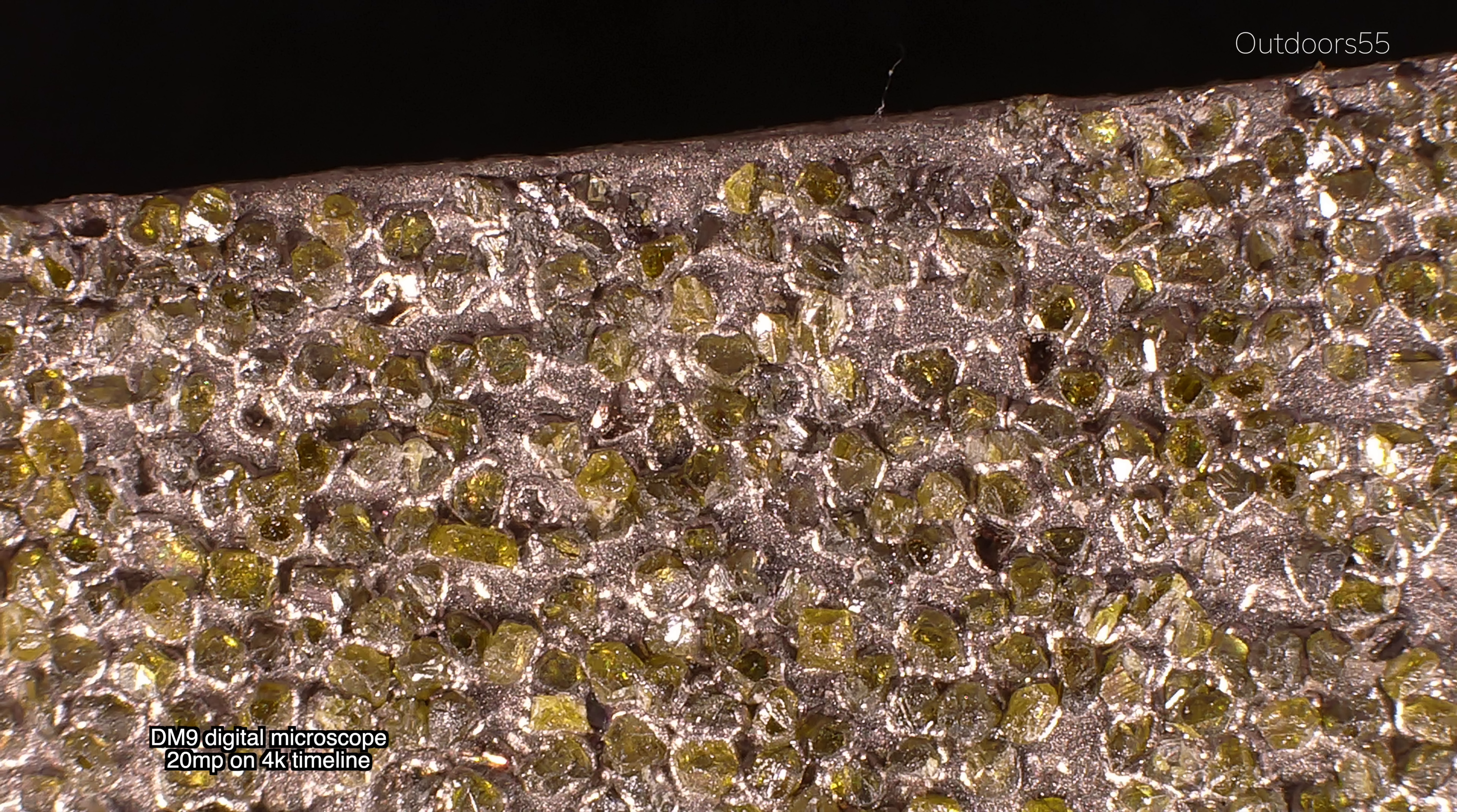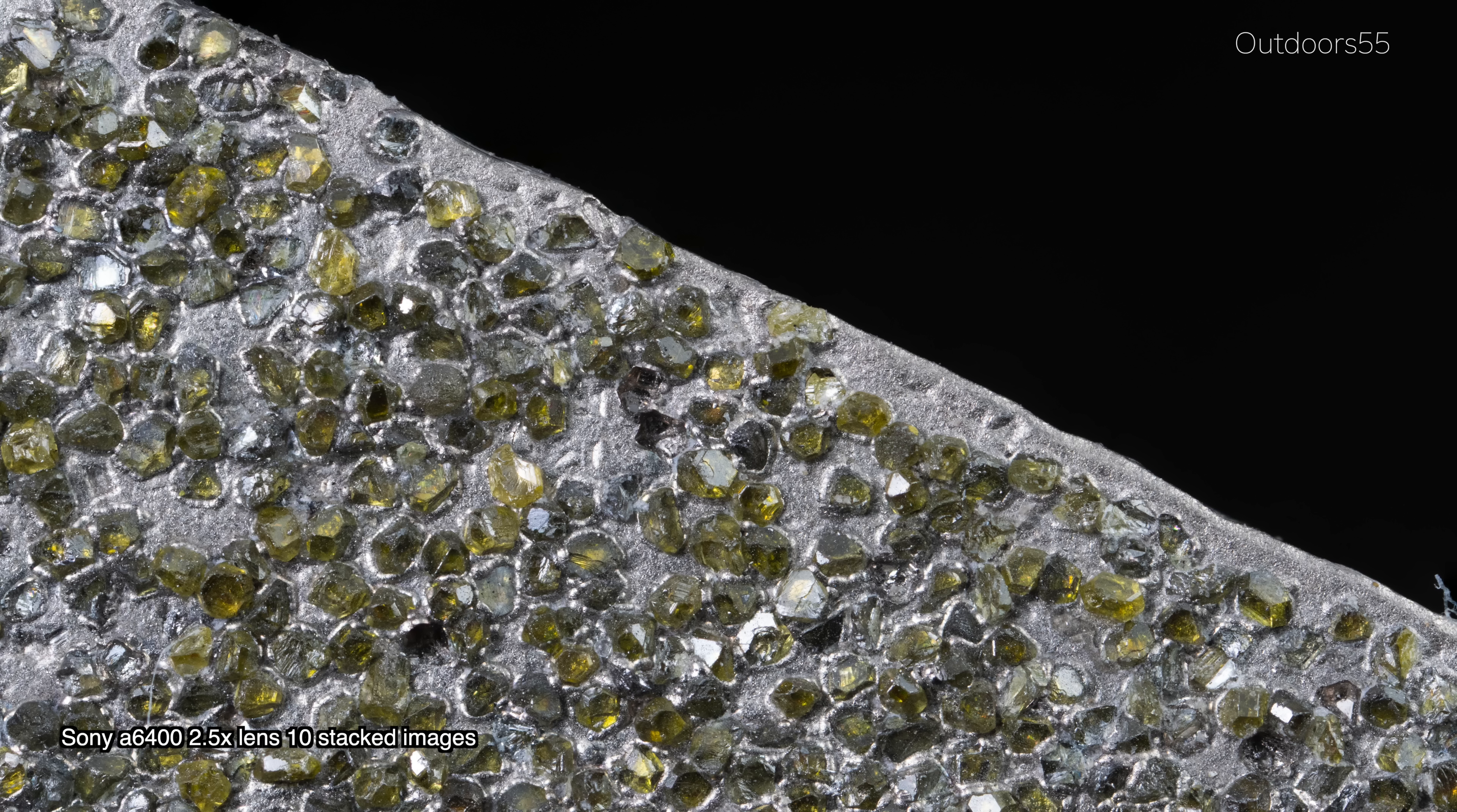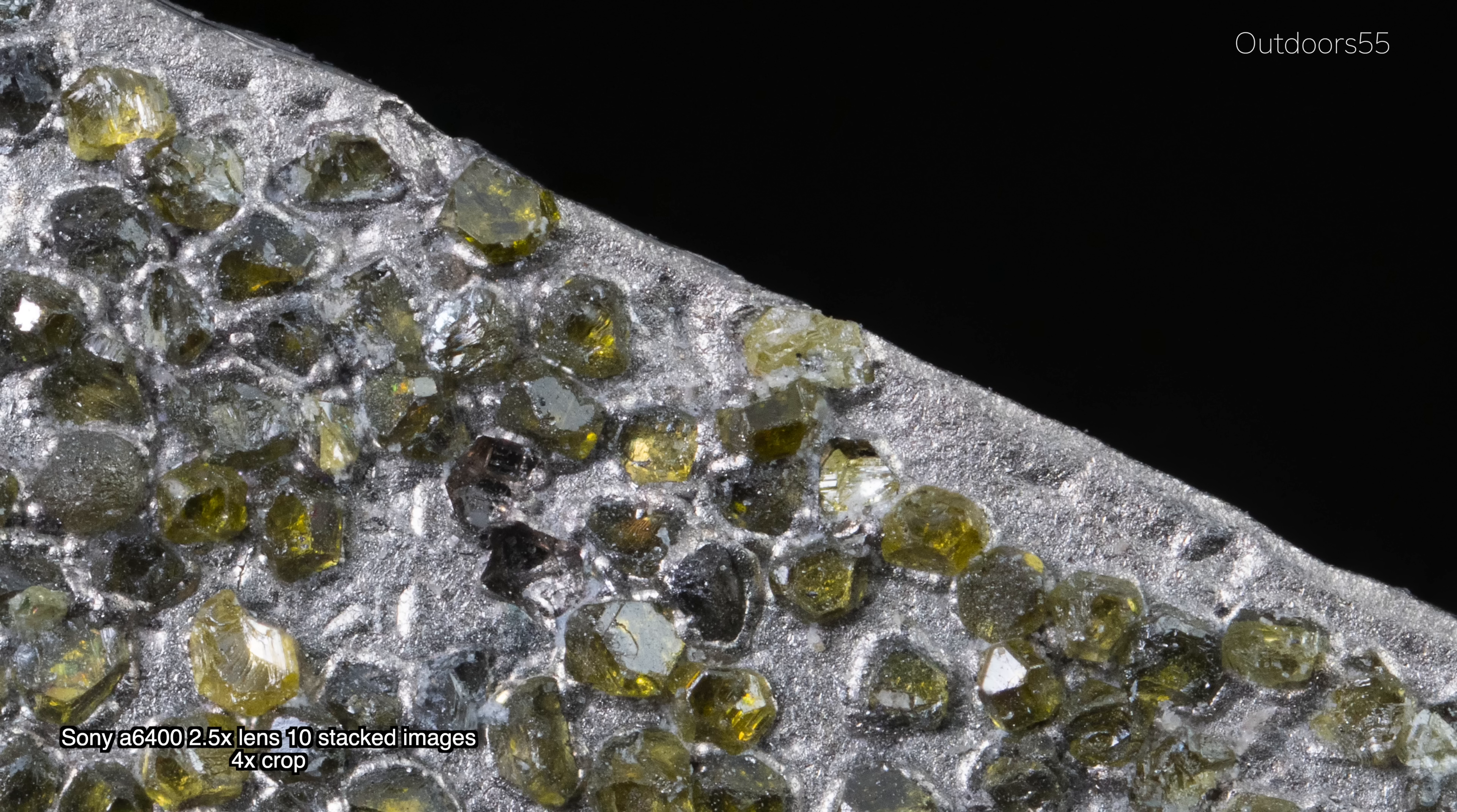And then one more photo of a KME 50 grit diamond stone. This is our DM9 digital microscope and this is our Sony a6400 about 10 stacked images with a 2.5X macro lens.